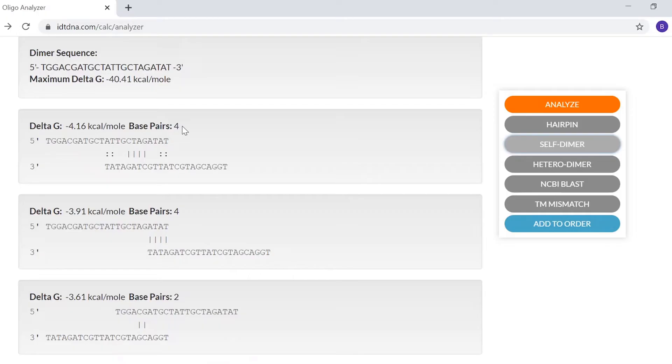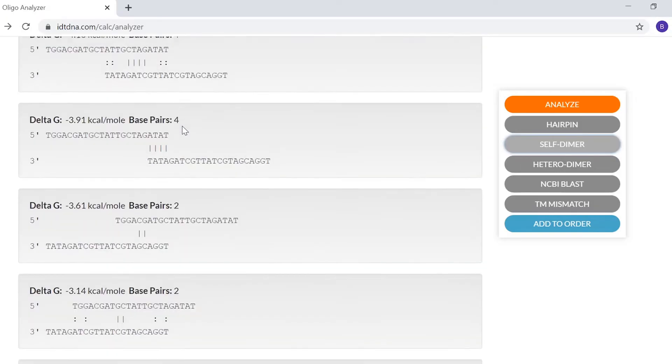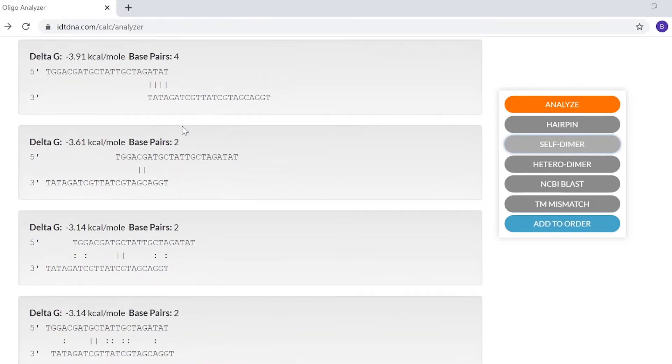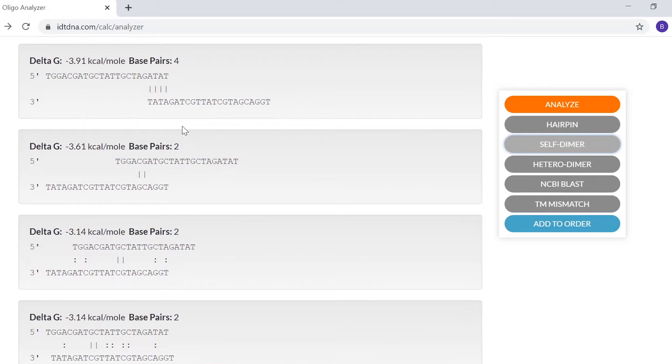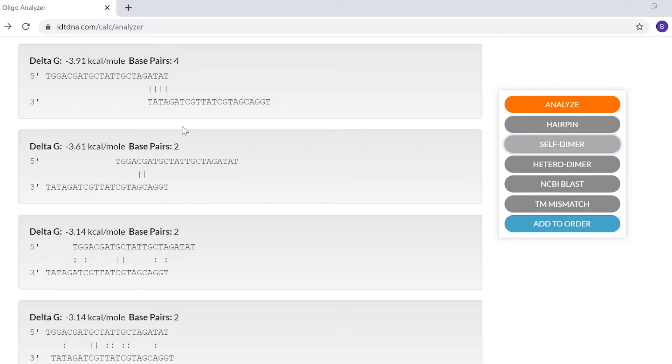Let's look at another example. The second structure shows four annealing bases at the 3' end of the Oligo. When both primers have four or more matches on the 3' end and a delta G value more negative than negative 6, you risk getting an extendable primer. In that case, we would suggest redesigning the Oligo if possible.